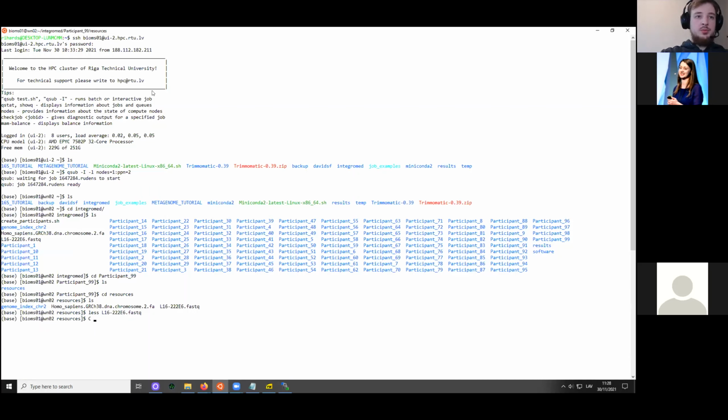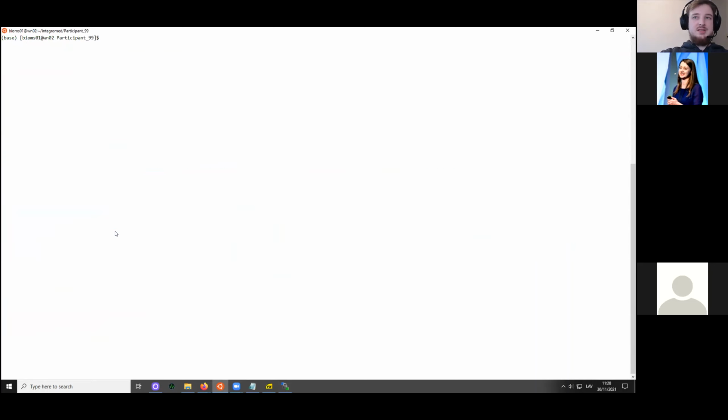So now we'll go back one step. As I told you in the presentation, we can type cd .. enter, and we are back in our participant folder. One thing that I didn't mention in the presentation, there's a command called clear. So when you're feeling that there's too much information on the screen, you can just type clear, enter, and it just empties the screen, but the information is not lost. Or we can type list again. We can see that it's still there.